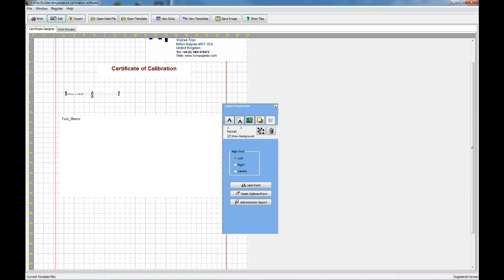We're also going to place another static text box and just call that job reference, and line it up to suit. You can use the print preview at any time, by the way, to have a look. We put another static box immediately to the right of it, and once we've done that, we'll scroll through the drop-down list again to find the job reference, job number field.